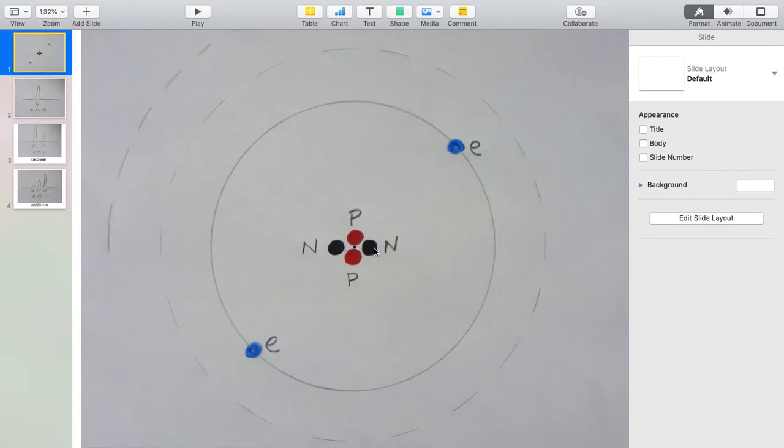And this tends to be different for different elements of the periodic table, because the arrangement of protons and neutrons is a bit different, and so the energy is different. So this means that you can make a precise measurement of the mass of an atom, and this will give you another indication of exactly what it is. This doesn't matter so much for looking at elements, of course, because we could identify those just by the integer number of protons and neutrons.